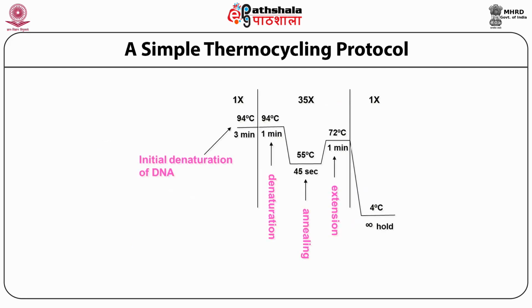So to conclude, PCR is divided into 3 stages, where the first stage is denaturation of double-stranded DNA into single strand, and the timing of denaturation is very important. If the DNA template originates from plasmid, then 3 to 5 minutes of denaturation is adequate, whereas if the DNA template is genomic in origin, 7 to 10 minutes of first denaturation is always recommended.